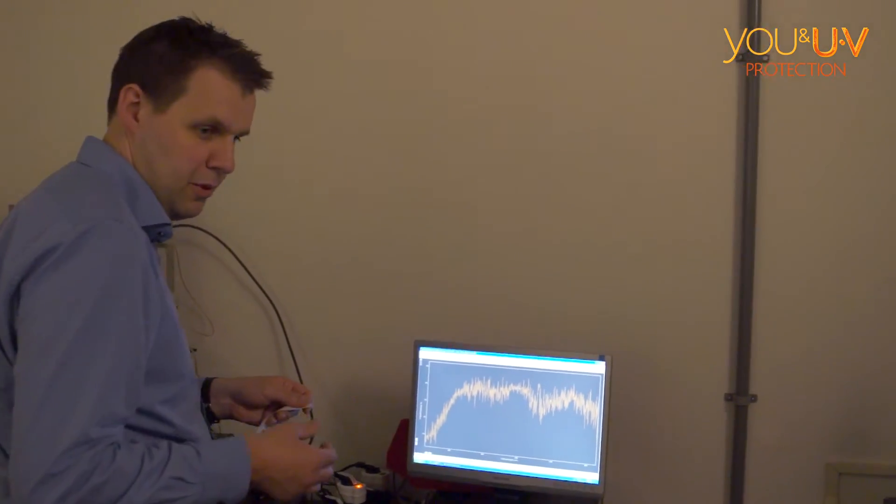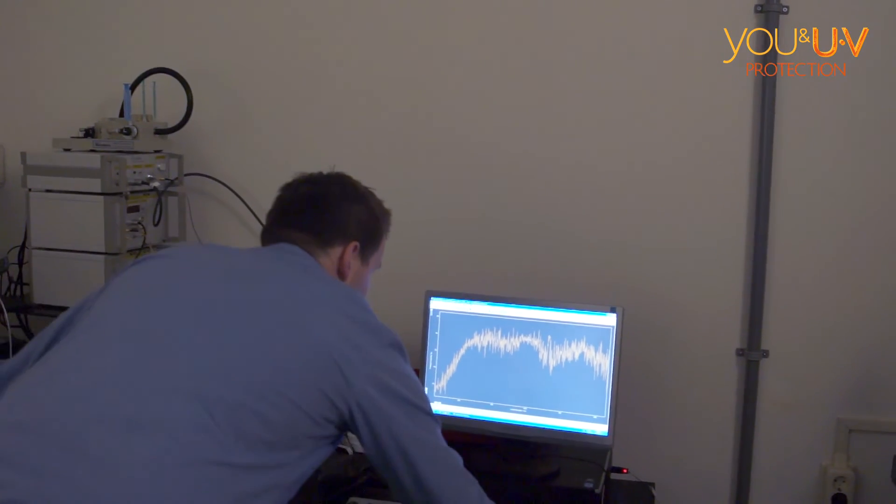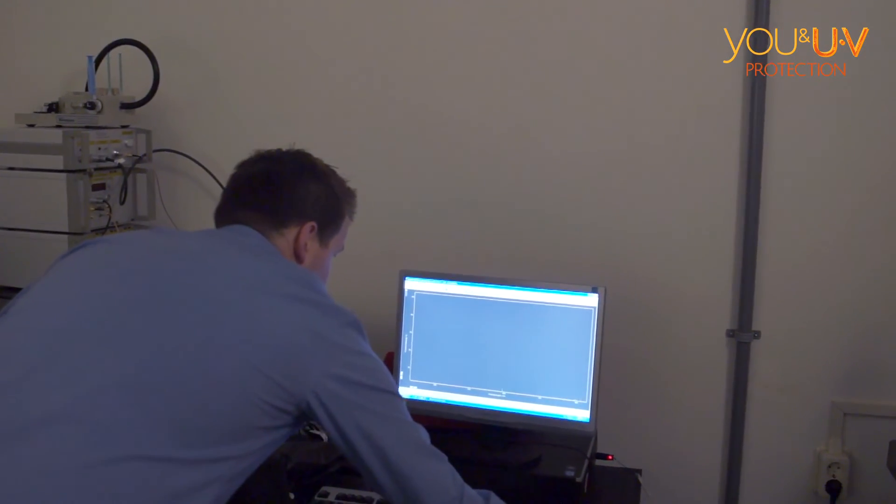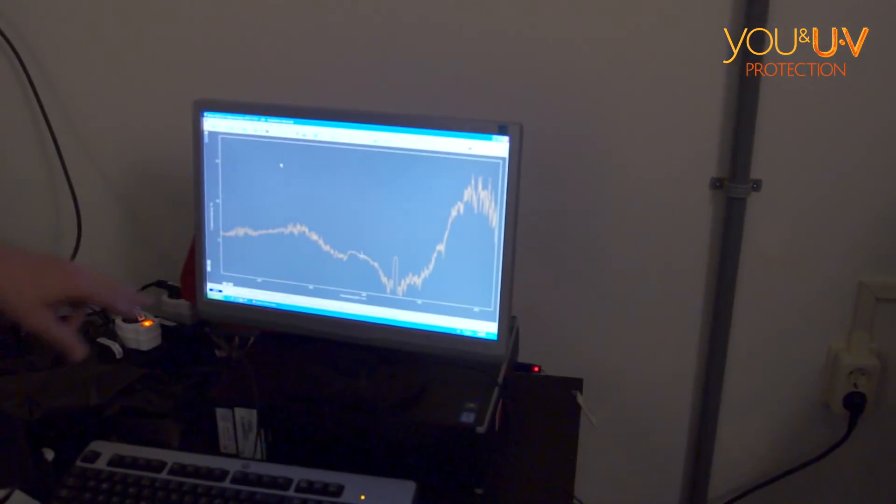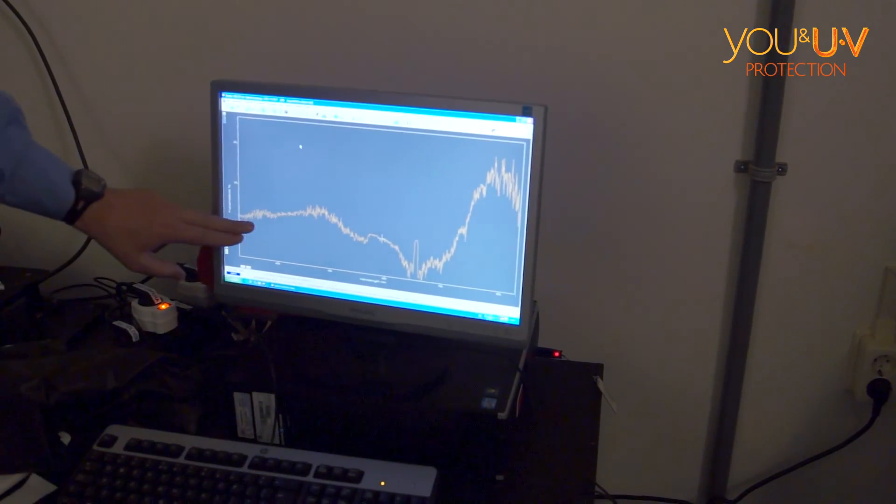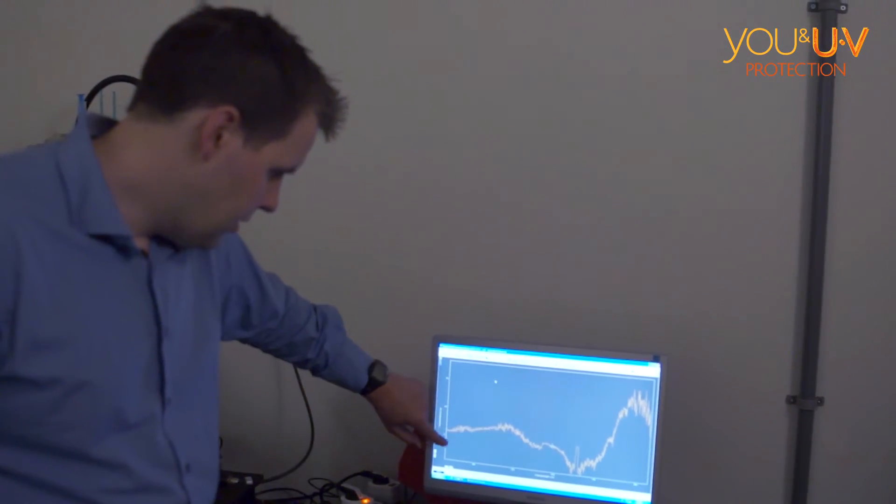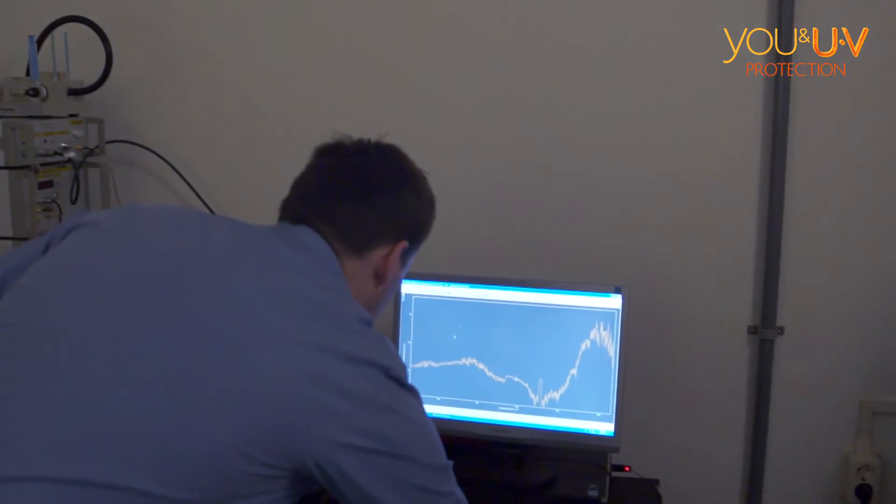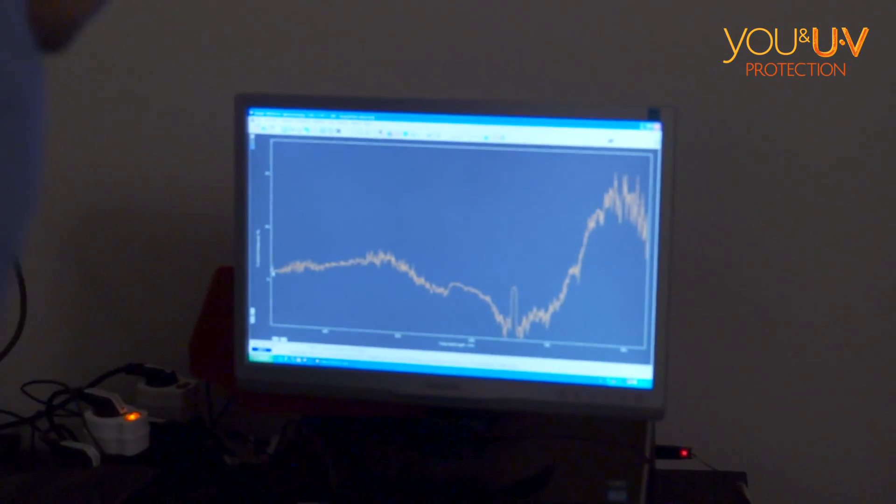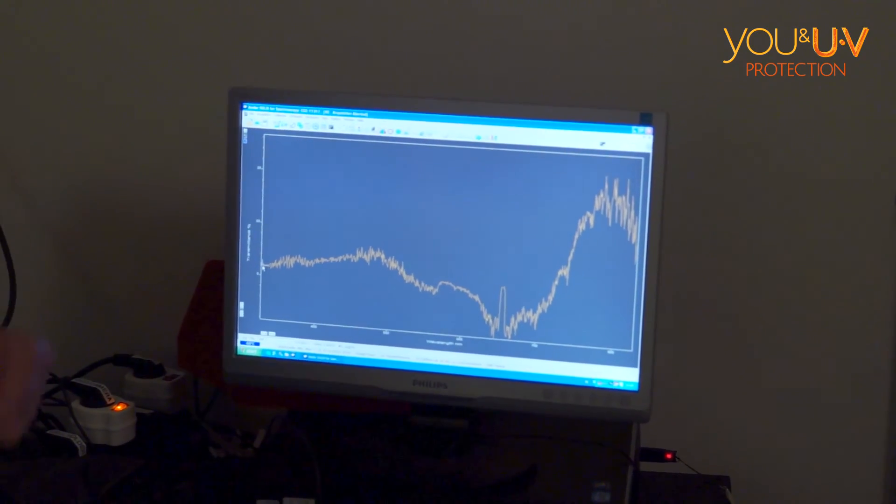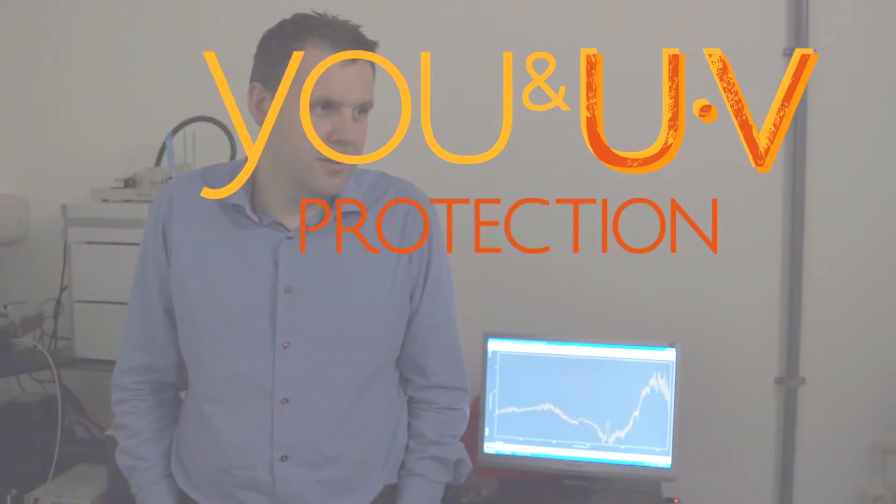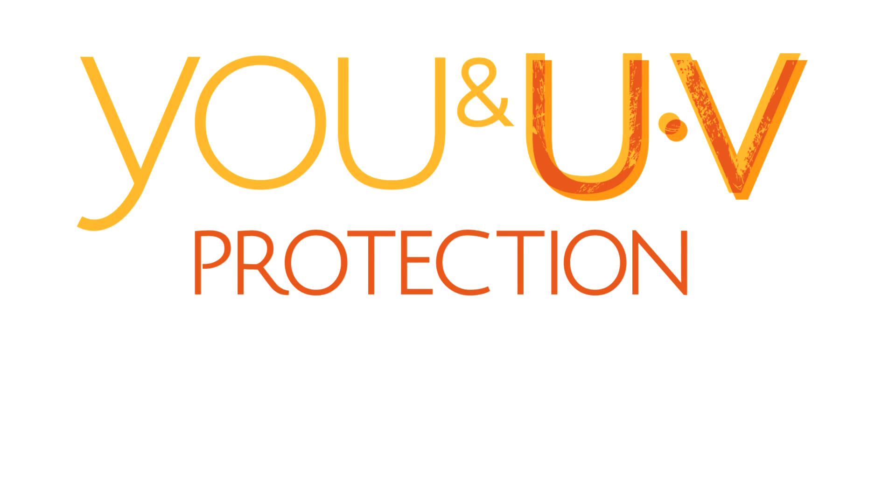No. Do you have a UV blocker? It's quite tight woven, and it blocks all the light, but not everything. But this is the region we're interested in, down to 325, this is the UVA region. So you get about 2 or 3% transmittance. And if you look at how the NEN test is applied by commercial providers, it's exactly the same as we do here.